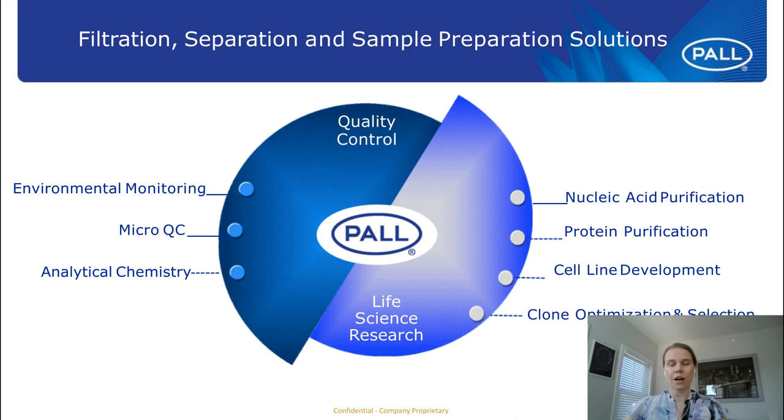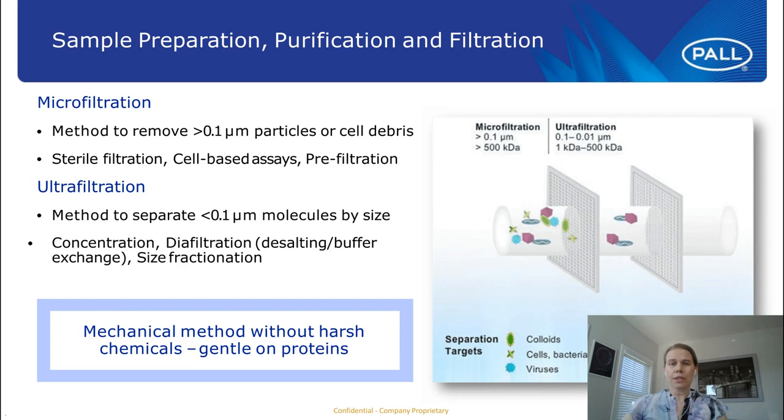So when we talk about sample preparation, purification, and filtration, of course, this is not the area where you would like to spend a lot of time thinking about it and putting a lot of energy into it. However, I think it's really important to understand the filtration methods, because selecting the right method for your application may affect your outcome or initial data and even your molecule quality.